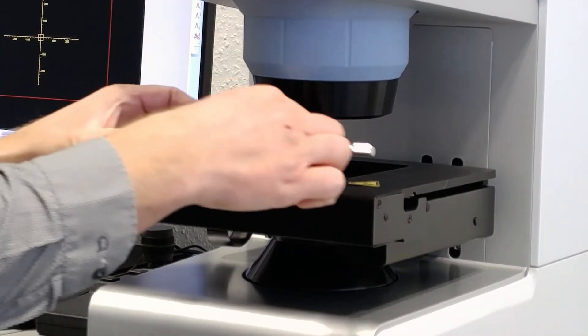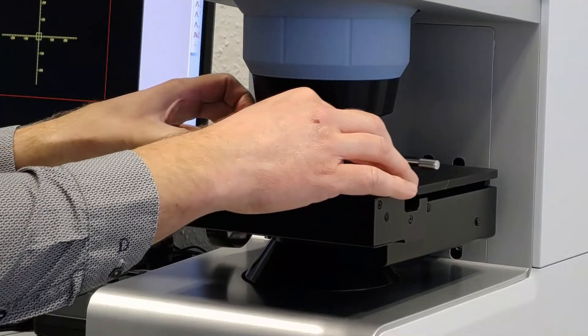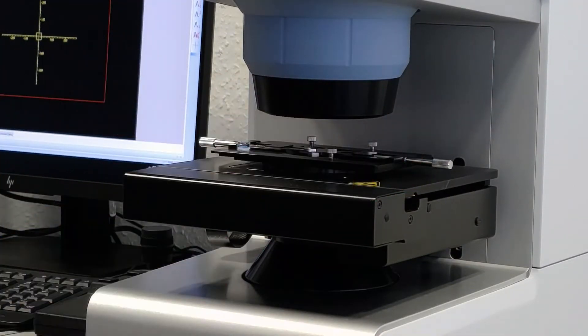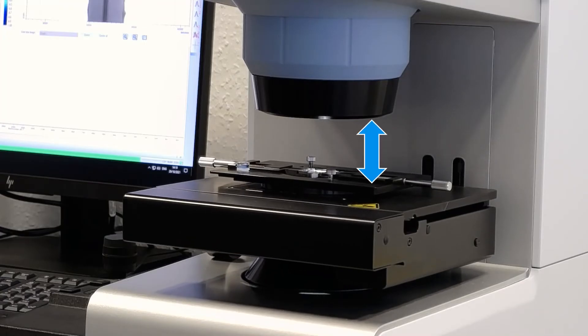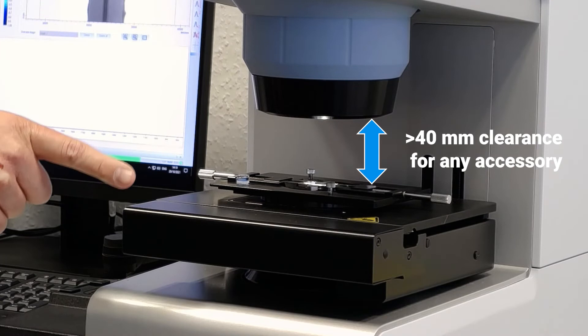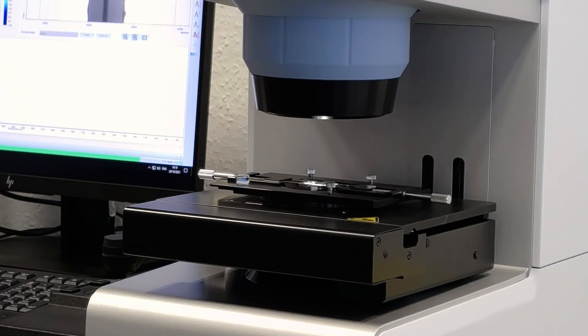The sample is analyzed using Bruker's Lumos II FTIR imaging microscope. First, the region of interest is selected with each red square representing 1024 IR spectra that are simultaneously collected. When we click start, the Lumos II automatically collects the IR data.